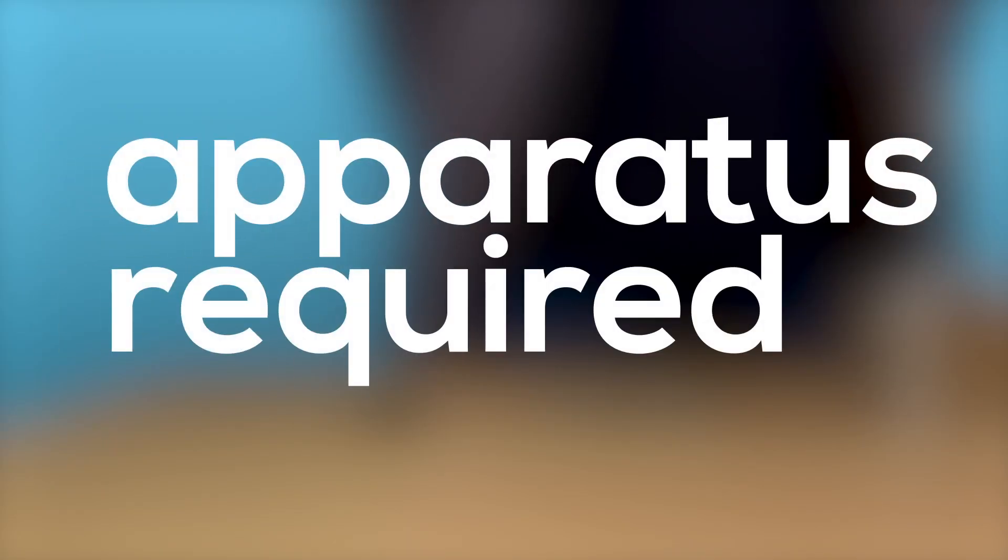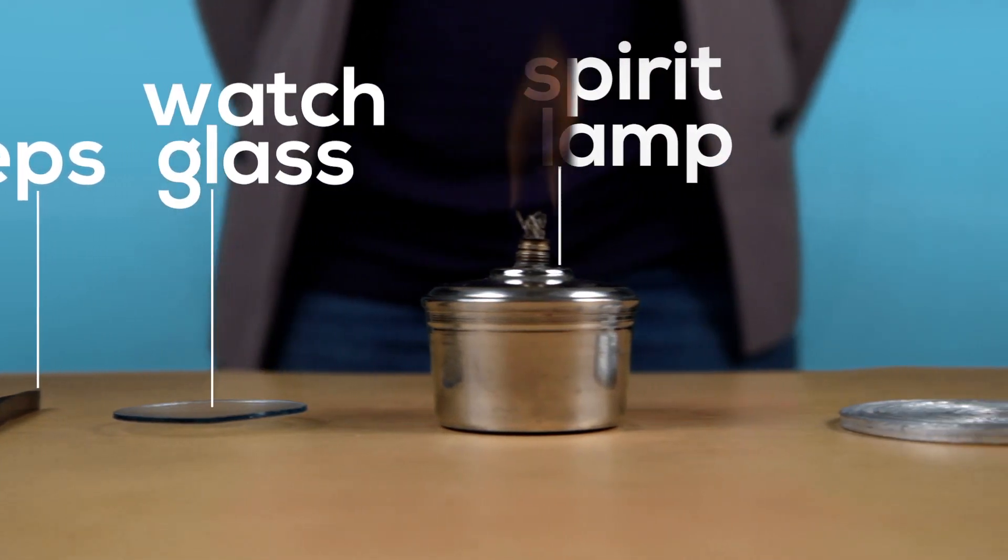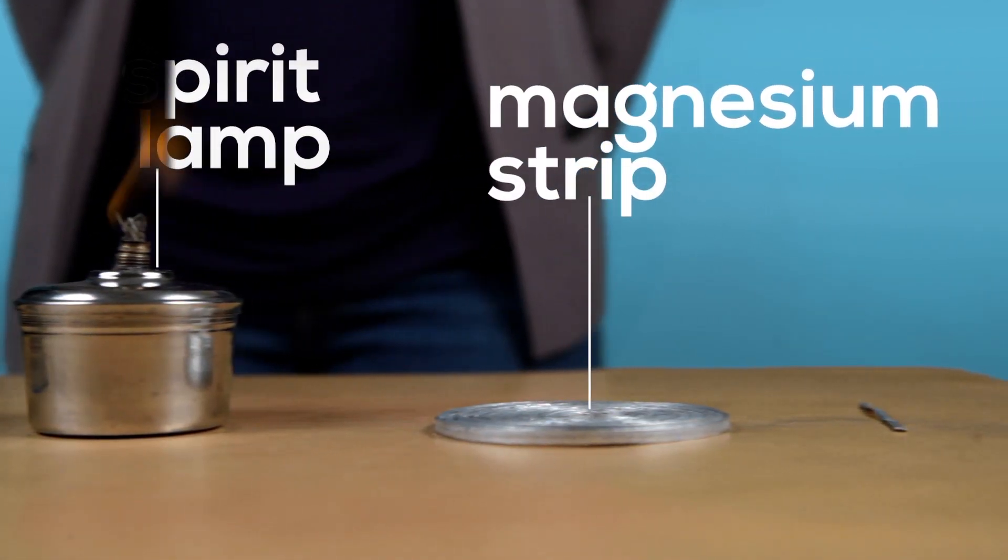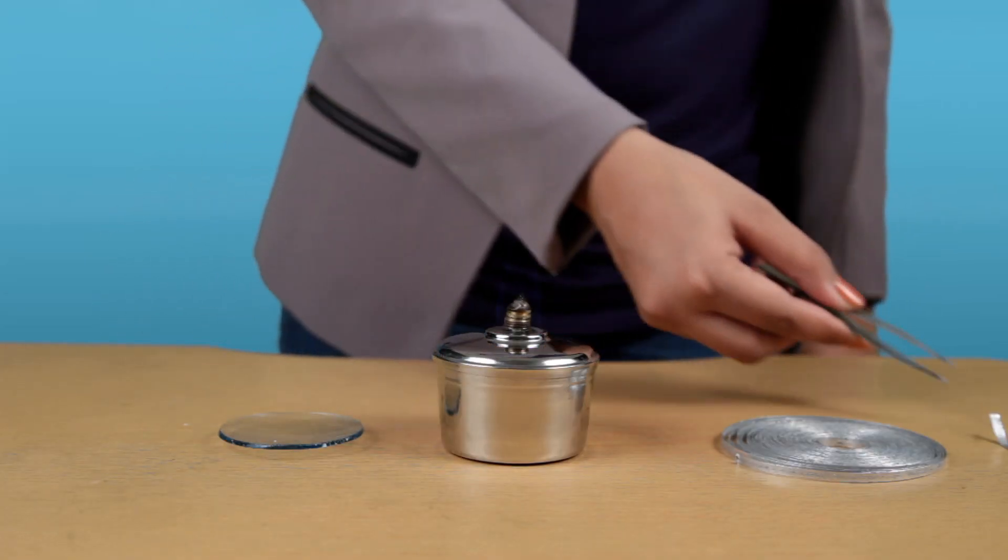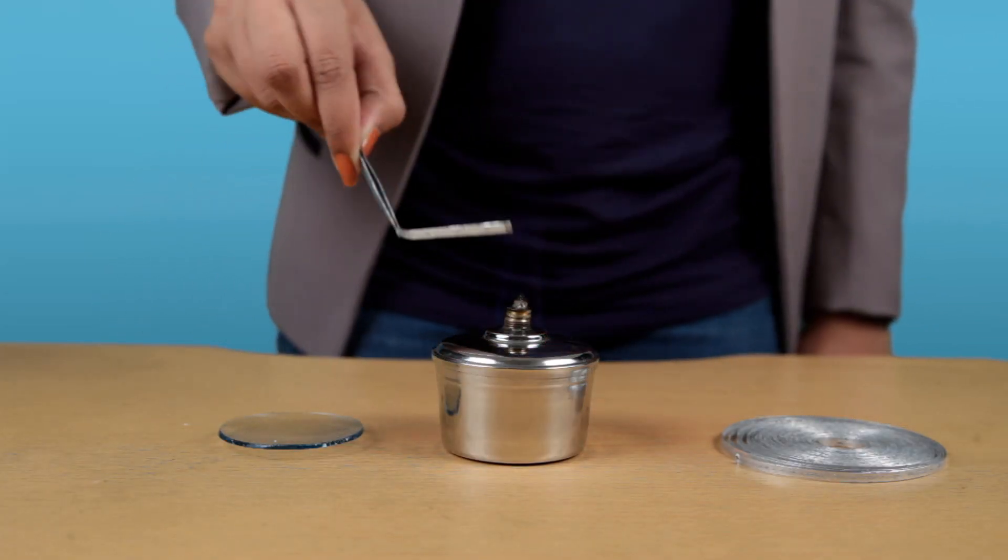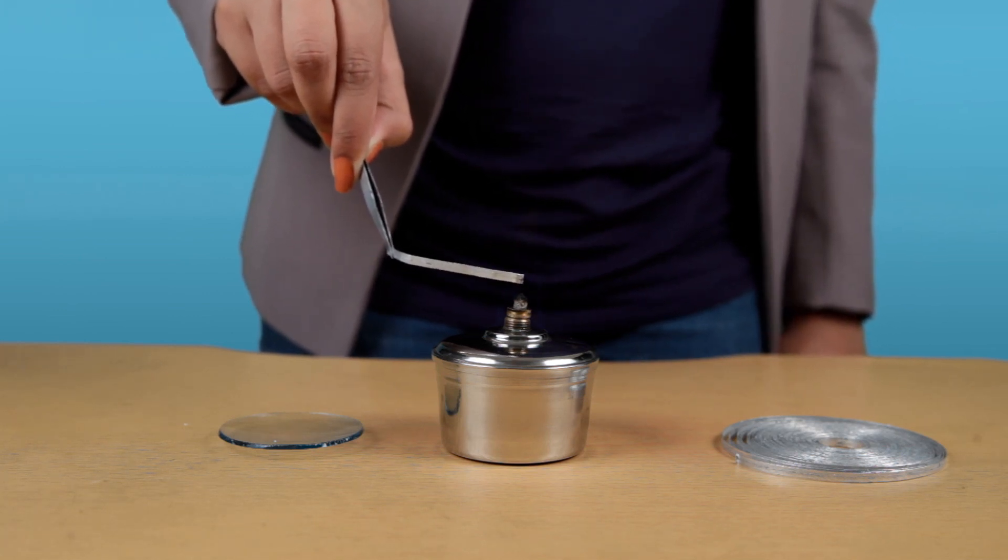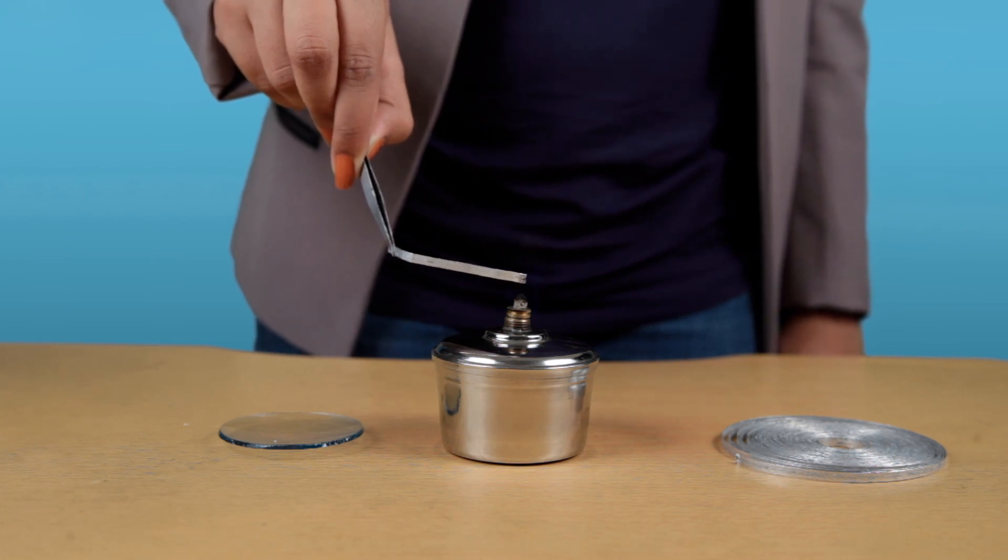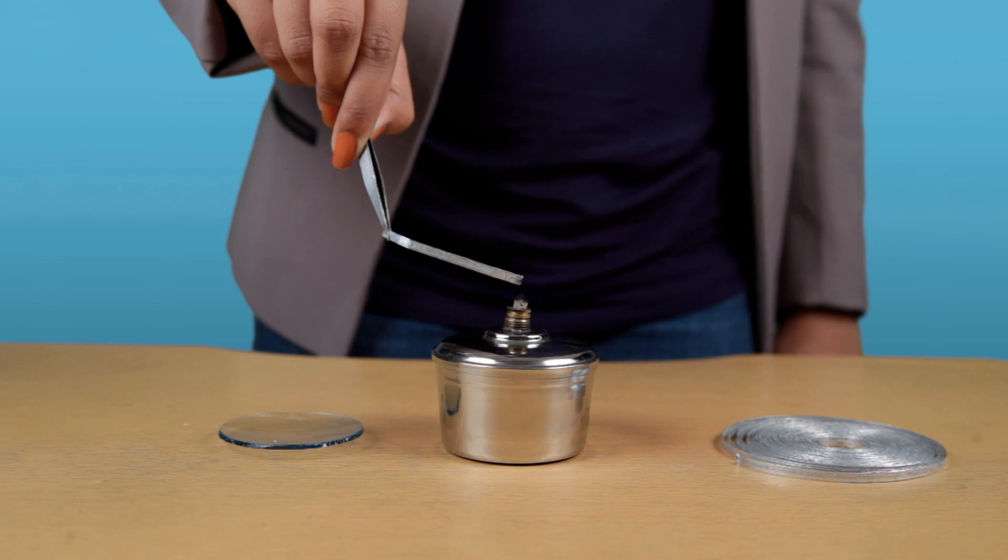For this experiment we need a forceps, a watch glass, a spirit lamp and a magnesium strip. I will hold this magnesium strip with the help of this forceps and now I will burn it over the burner. I have put a watch glass below. I have to be cautious while carrying out this experiment by keeping my eyes as far as possible.